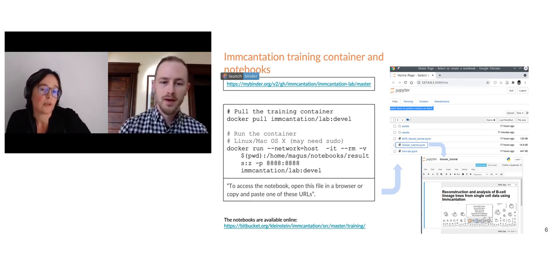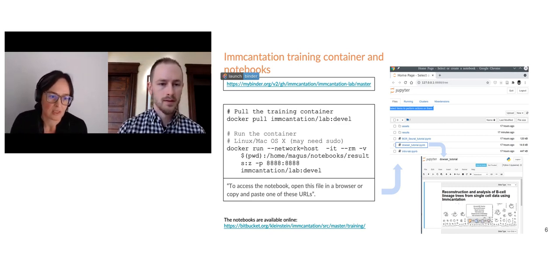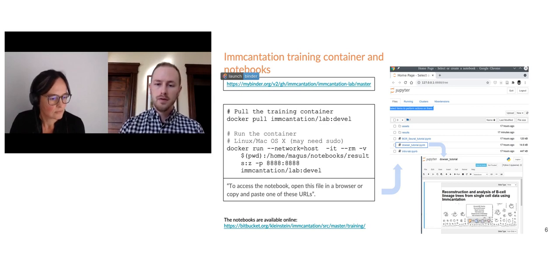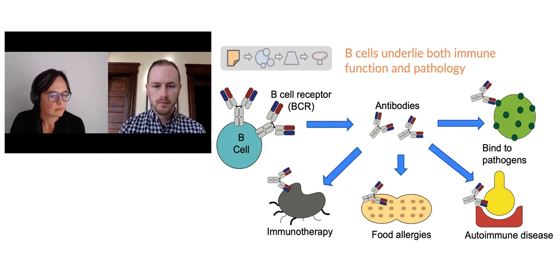Okay. I will take questions if someone has questions, actually. Cool. Fantastic. Thanks, Susanna. So if you have questions throughout, I think you can ask in the Q&A, and Susanna can monitor that. So before the analysis part of the tutorial, I'm just going to do a bit of review to make sure everyone's on the same page.